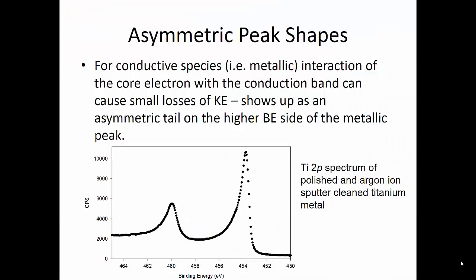The next thing we need to look at for the metallic peak is that it's going to have an asymmetric peak shape. You can see that here from a standard sample of polished titanium that's been argon ion sputter cleaned. You have this very nice asymmetric peak shape in both the 3/2 peak and the 1/2 peak, so we have to fit that in.